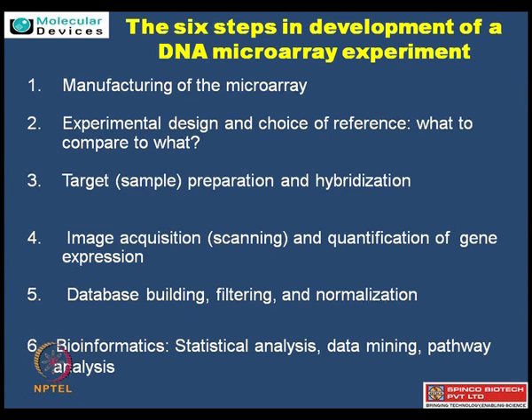Once you are ready with these two, the next thing is the sample collection and the target or sample preparation, which can then be hybridized to the pre-planned chip, which is now ready to go for the scanning in the form of image scanners. The fourth step involves the hardware, where we as a vendor from Molecular Devices come in place, and this data once scanned in the form of raw data can now go through data filtering as well as normalization, followed by the last steps of bioinformatics and biostatistics, which help in the data analysis. In this fashion, these 6 steps are important for any microarray experiment.